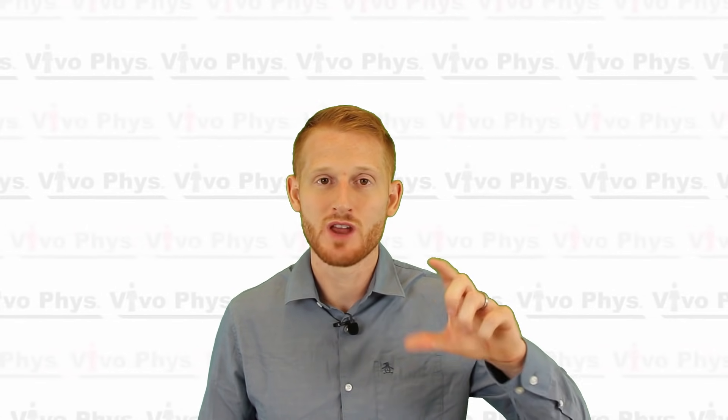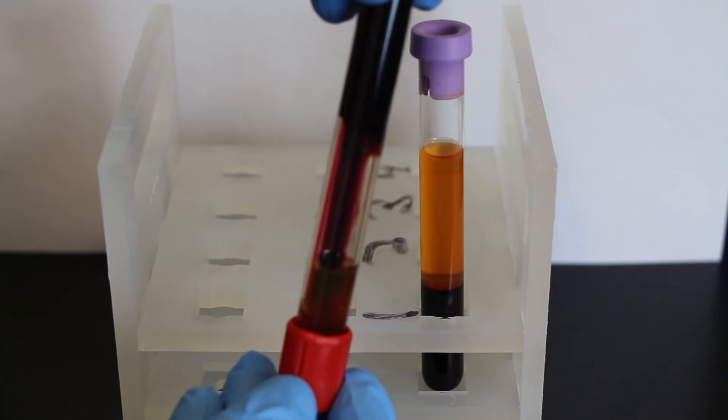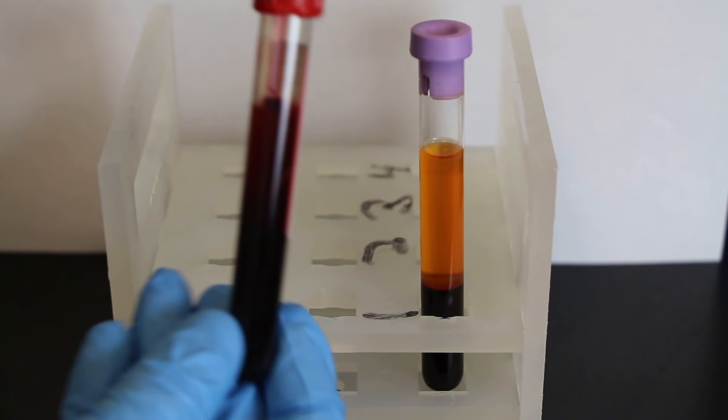When you're taking the tubes out of the centrifuge and to wherever your workstation is, or when you're working with them at the workstation, make sure that you never invert those tubes again. If you invert the tubes, you're going to see that the blood remixes partially, and essentially you're ruining your sample by doing that.